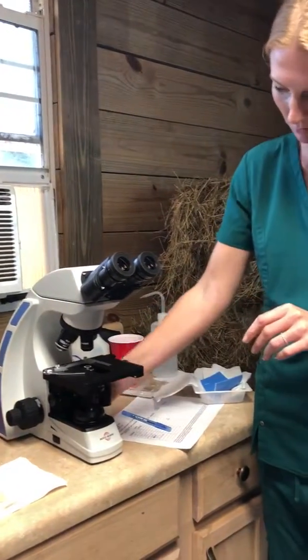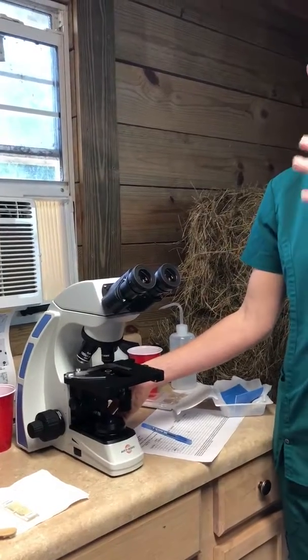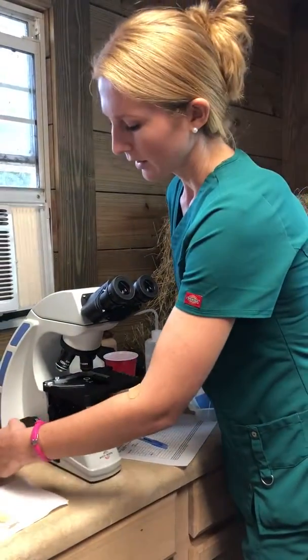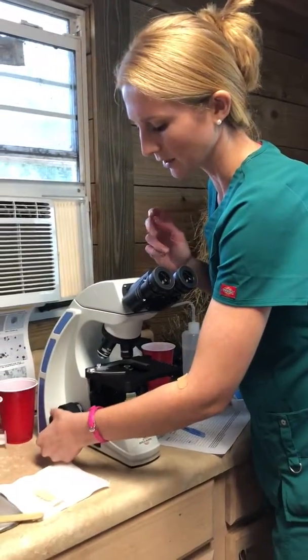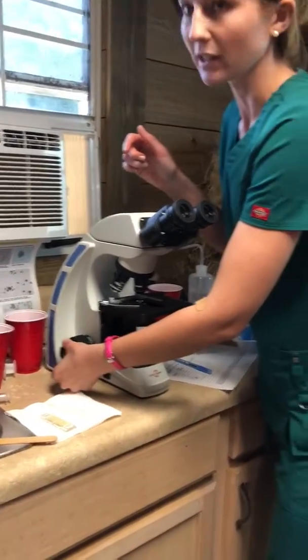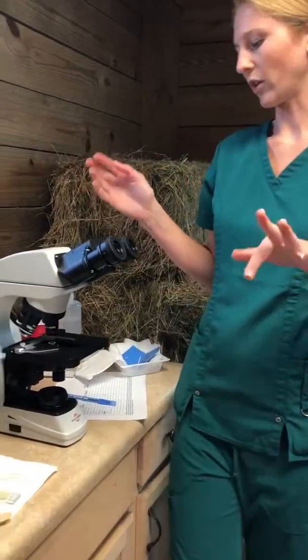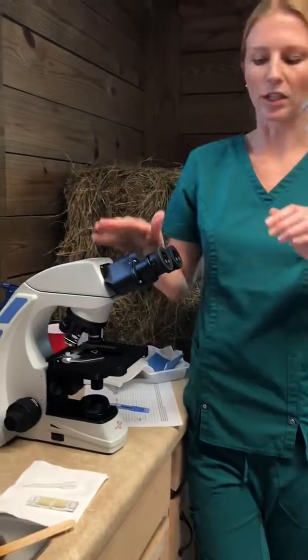This stage will have to get moved up to about that point, and you'll be looking through to see when it starts to come into focus. This big knob is called the coarse adjustment — it makes those really big movements. This little knob on the outside is the fine focus. The fine focus will make it really defined when you're looking through the eyepieces.